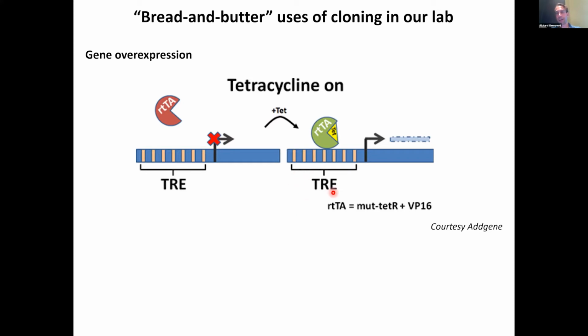And often inside either those transposon or LTR sequences, we'll put a separate cassette which has resistance against a mammalian selective agent. The most common ones we use are blasticidin, hygromycin, puromycin, or neomycin. Those are all drugs that will kill mammalian cells unless there is a resistance gene.